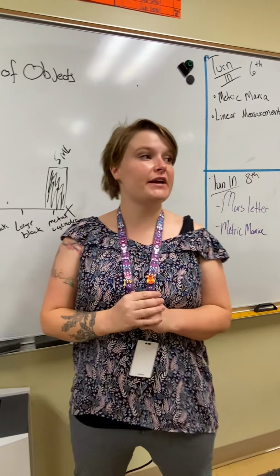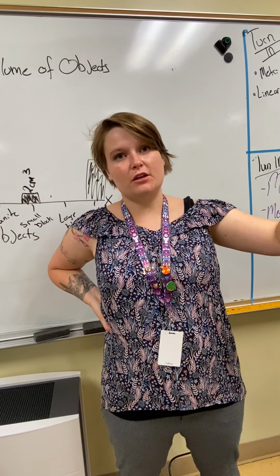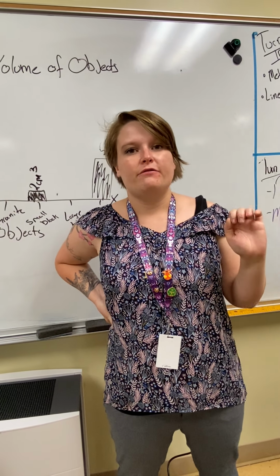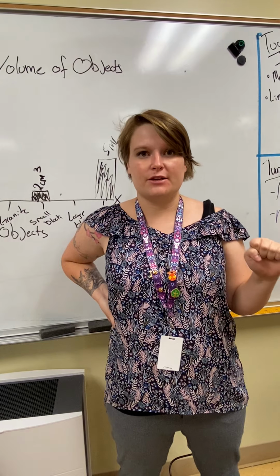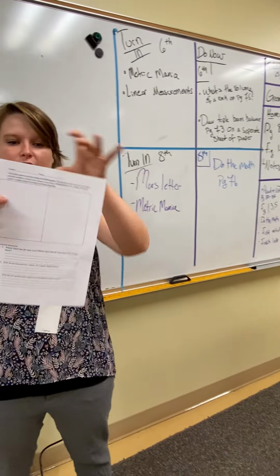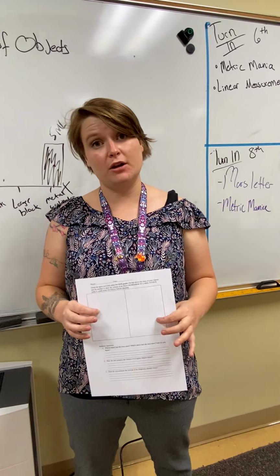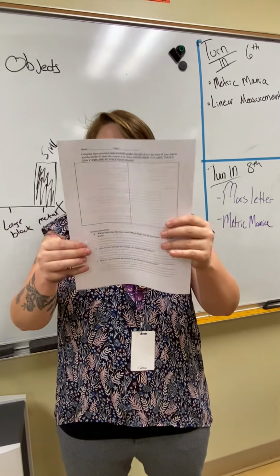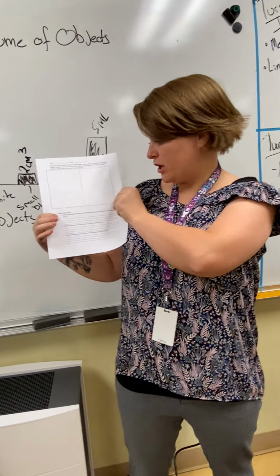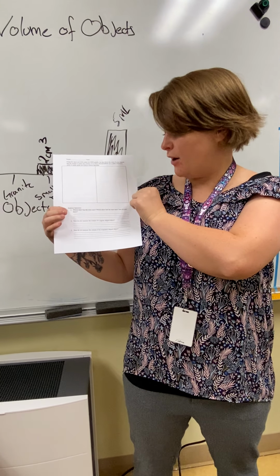All right, so this is the basics of this lab. I'm gonna leave the rest to you. You're gonna have to read the measurements of each and every object and then the volumes of each and every object. Feel free to watch this video as many times as you need to get the information. Then once you are done with your two graphs that you're gonna put into these two boxes, or if you do not have a printer at home, then you can put on a separate sheet of paper. You're gonna answer these three questions, right? You are gonna say, what object has the most mass? Which object had the least mass? How do you know?